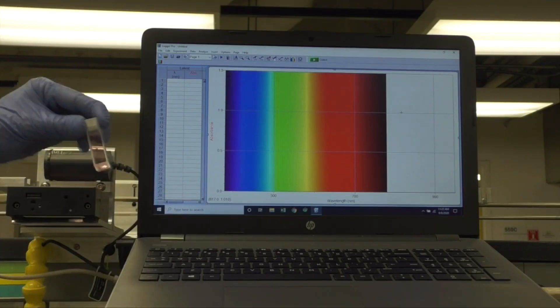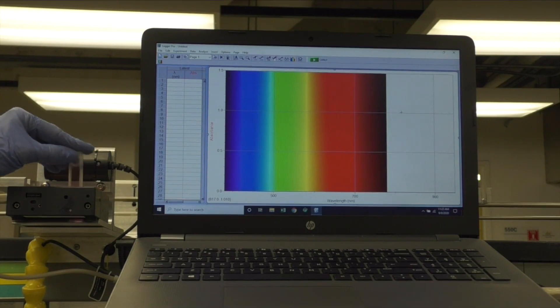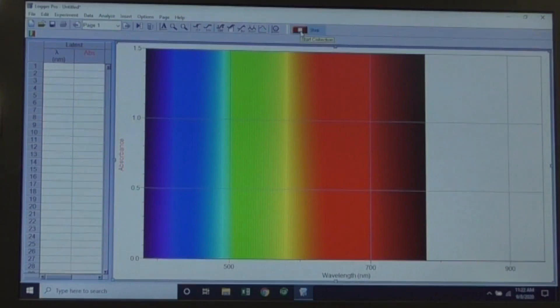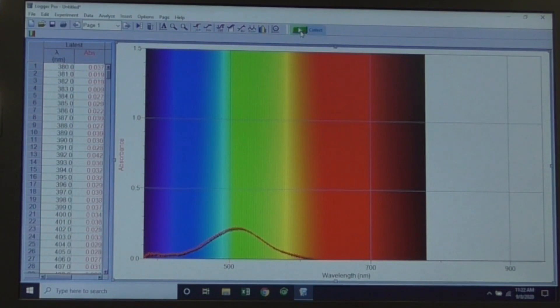Wipe the cuvette, place it in the spectrometer and click Collect. Wait a few seconds and click Stop. Remove the cuvette.